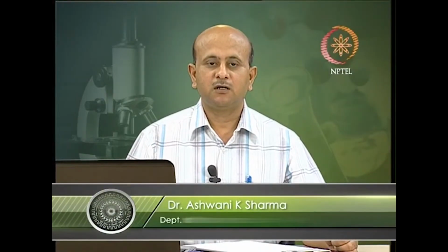Now, how do you distinguish them? Let us see, and then we will go into detail. First is the illumination source or system. Now, the illumination system is made of, first, the electron gun. What does the electron gun do? It generates electrons and provides a coherent electron beam.